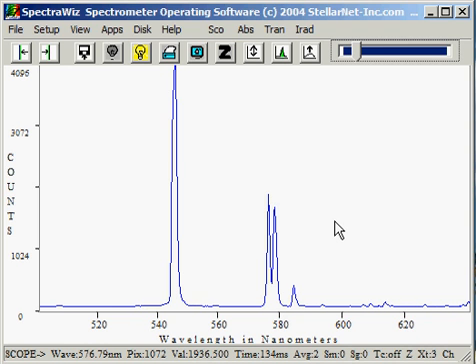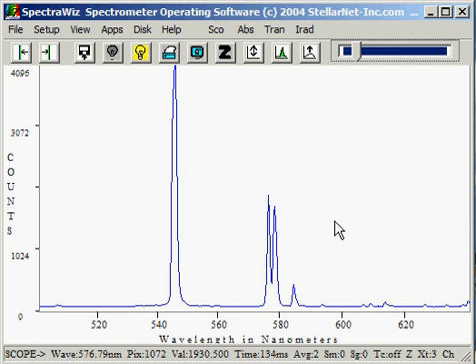In this demonstration, we're using the EPP2000C concave grating UV-Vis spectrometer attached to our SL2 wavelength calibration source. This provides emission lines from mercury and argon gas tubes.